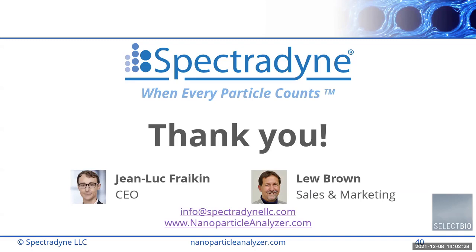Okay. And then the other question that I have is, what are the ranges of the microfluidic devices that you use for measuring? Because you mentioned that you have a wide range from 50 nanometers to 10 micrometers. What are the ranges of these cartridges? For example, if I'm measuring something that is between 50 and 500 nanometers, do I need 2 cartridges, or could it be done with 1?